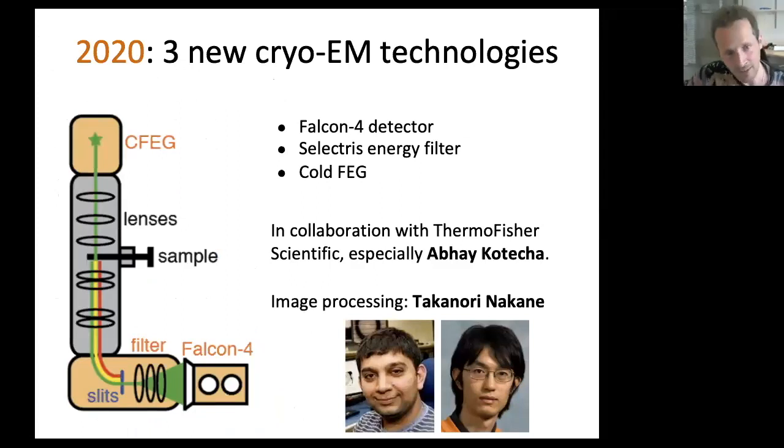So in 2020, that was last year, and the paper was actually written from my attic at home during lockdown, we made another step forward. So I mentioned to you the big step forward of the cameras and the image processing, but in 2020, Thermo Fisher was ready with 3 of its new microscopy hardware developments, technologies, that were all combined in a prototype microscope that was operated by Abhay Kotecha in Eindhoven at the factory where the Cryo-EM systems are made.